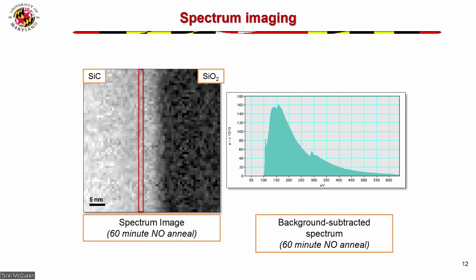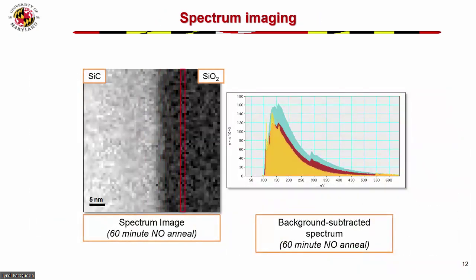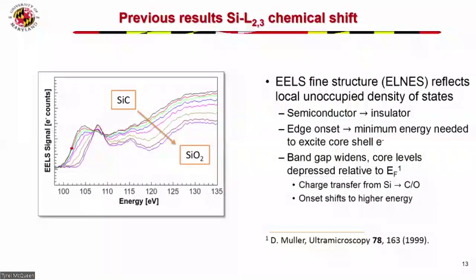This is pretty much 100 in the silicon carbide, but, oops, sorry, I went the other way. It's hard to see. There's a slight shift to higher energies for silicon dioxide. It's at 104, okay? And that is because those transitions change depending on the material, and because the energy gap is higher for silicon dioxide, it also increases. And that's also what we use to measure this.